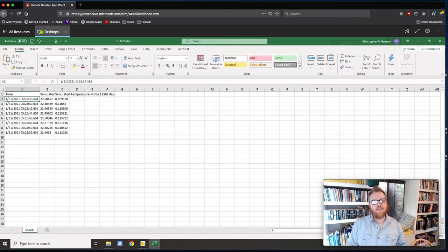But all the same, it doesn't matter because I've got the date in there, and that's what's important, right? This was at 5:25:39. The next data point was 5:25:41. So I have the feeling that it's something to do with my loop needing to go all the way around, giving me a data point every 2 seconds instead of every 1 second.